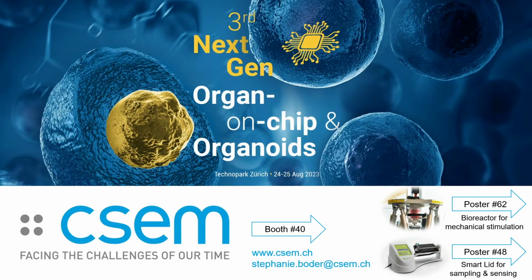Okay, so for the recirculation in this configuration, the goal was to parallelize the same tissues. We didn't care about mixing of the medium, so we have 6 inlets but only 1 outlet, and when we do the recirculation, all the outlet is coming back into the same bottle. So in this case, it is mixing the medium. With the technology, we could also customize the lid to have 6 inlets and 6 outlets, which would be quite easily feasible if we don't want mixing between the different wells.